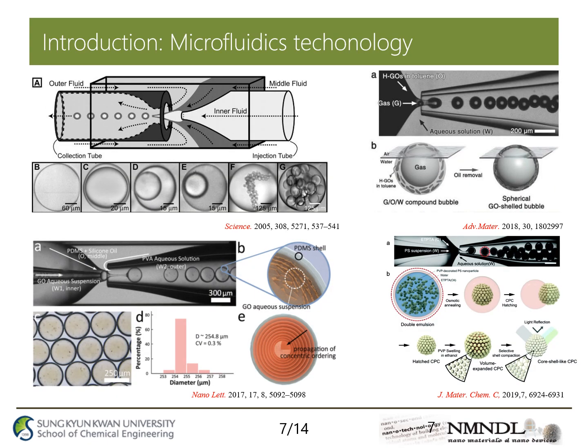Now, all the micromotors we have presented so far are pretty intricate and require scientific techniques to fabricate. Thus, I would like to introduce you to microfluidic technology, which is a technique used to manipulate the flow of microfluid and create bubbles and a vehicle to transport media inside of it. And the result is droplets with multiple shells and cores that are highly stable and monodispersed.